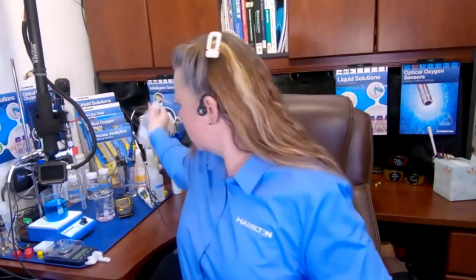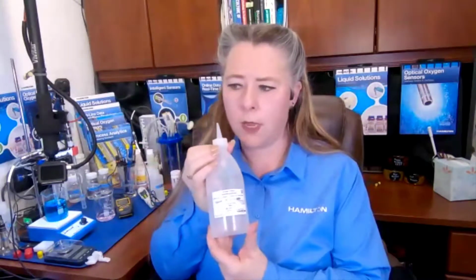Think about the gradient. Solutions want to go from high gradient to low, and water, distilled water, has no ions in it at all, so it's going to draw reference electrolyte out and eventually kill your probe. You should never let your probes go dry. Now I say that. And they should always be stored in storage solution, which is a buffered 3 molar KCl.